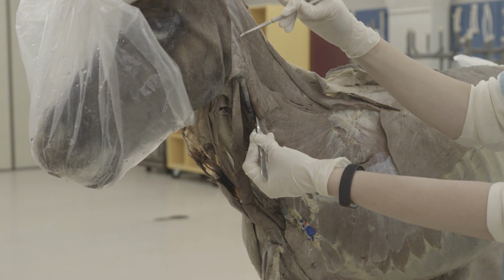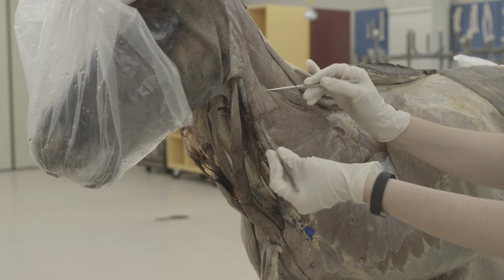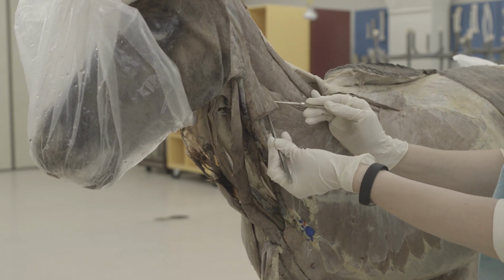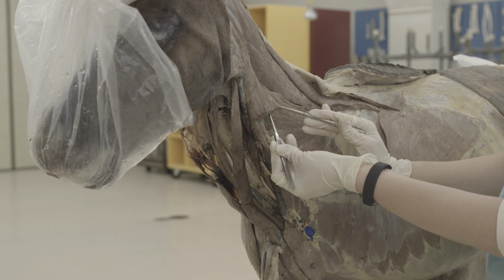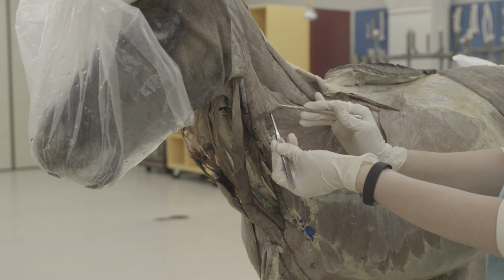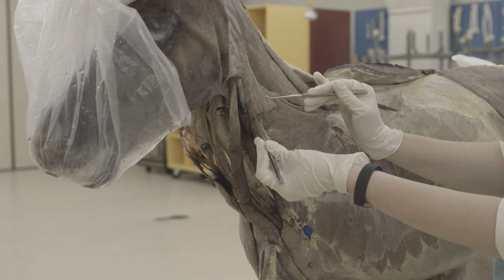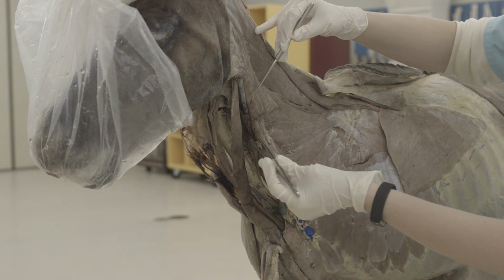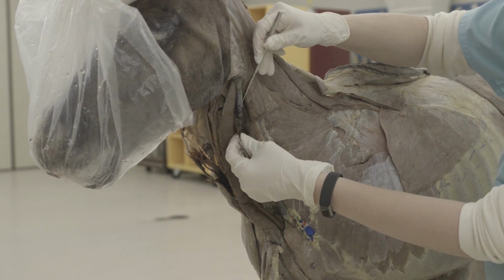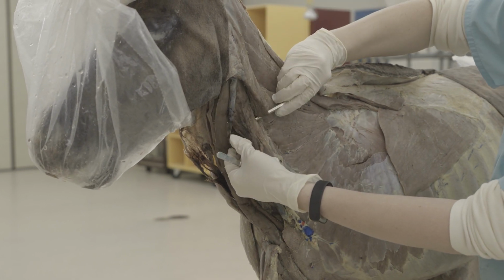So this is clidomastoideus here, and then the omotransversarius in the pony, remember, is fused to your brachiocephalicus, so it would just be this caudodorsal edge here would be omotransversarius, but you don't need to differentiate that separately because it's fused to that muscle. Then under that, you actually have the omohyoideus, which is significant in the pony. Right here is the omohyoideus muscle.